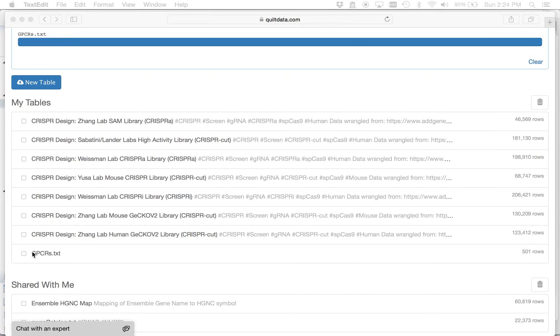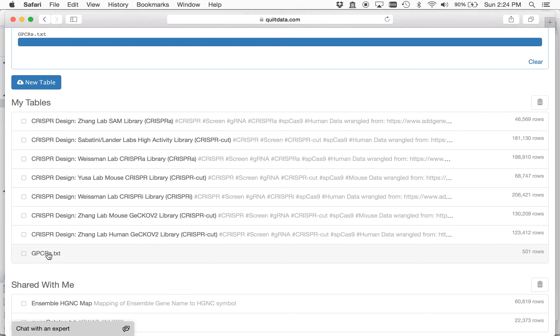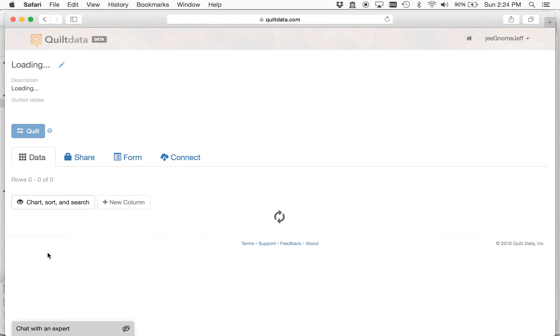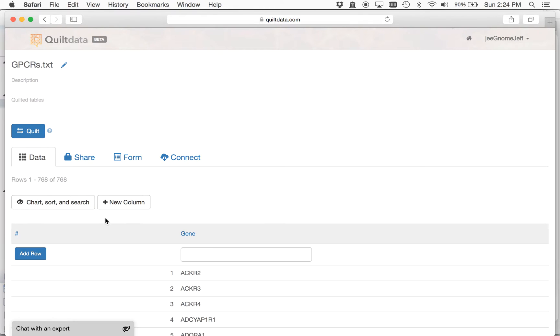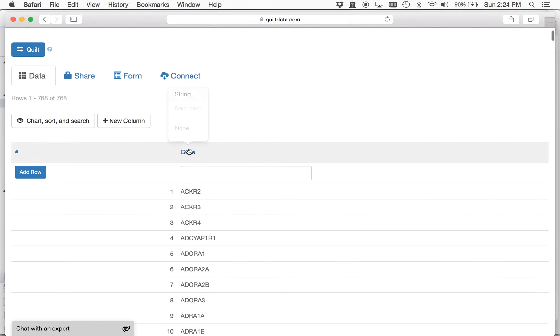Start out at zero rows, but it'll fill in. So I'll click here to look at this table, and what you're going to see is my gene list in this first row in the Gene column.